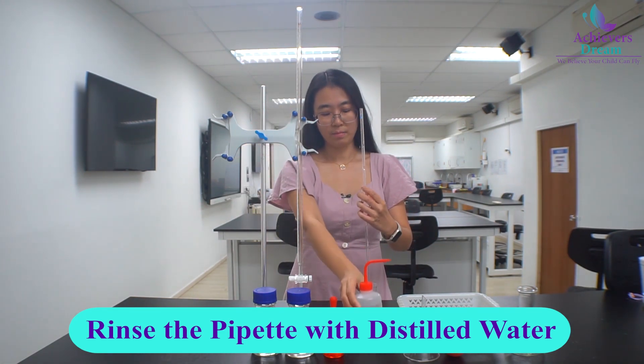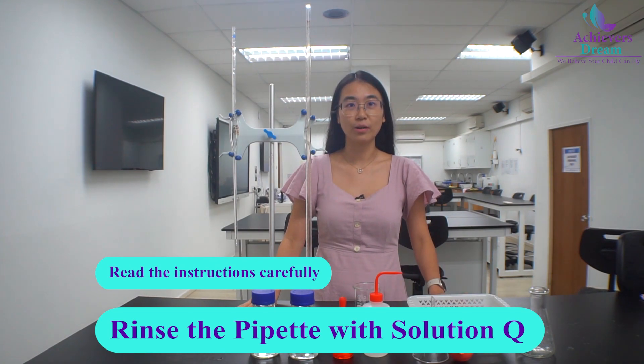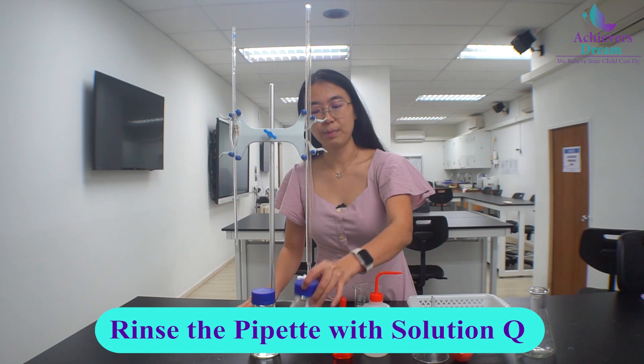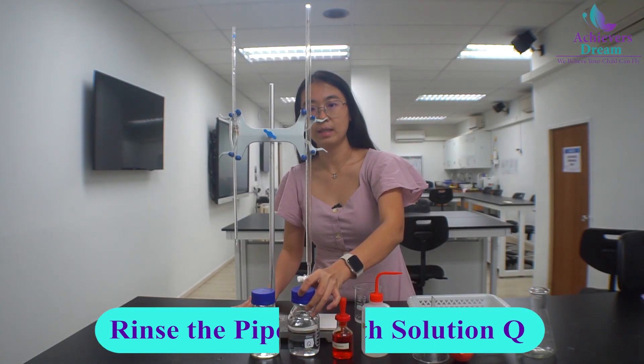Once you are done, just let the water flow out. Make sure you read the instructions carefully and use the correct solution for the pipette. So for this experiment, we are using solution Q to rinse the pipette.